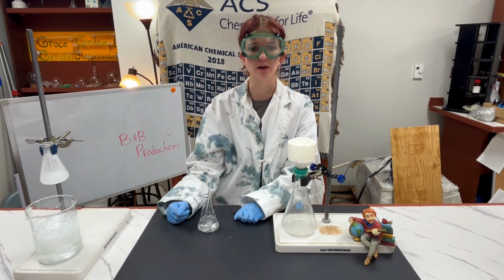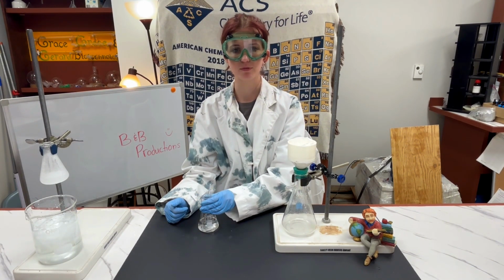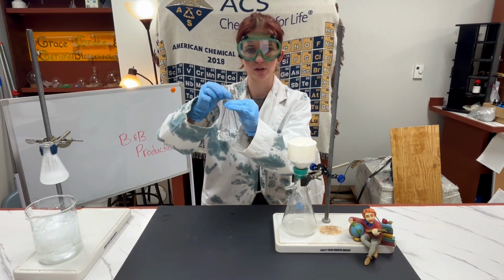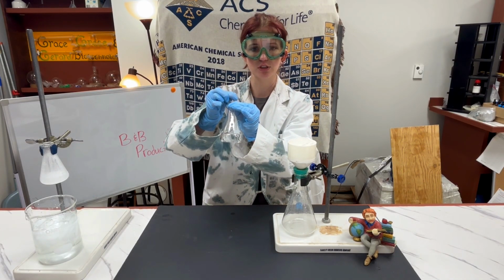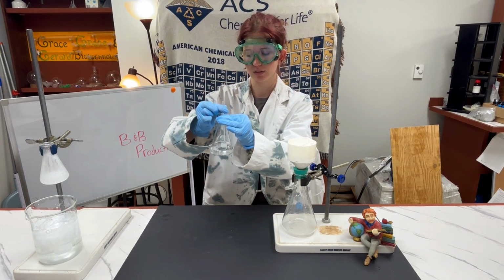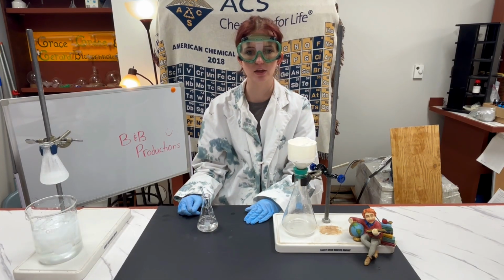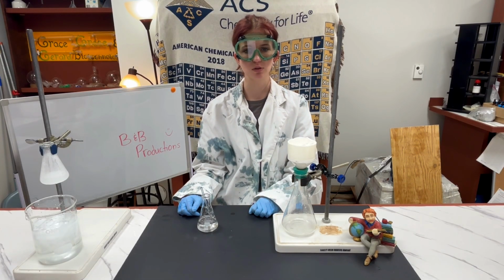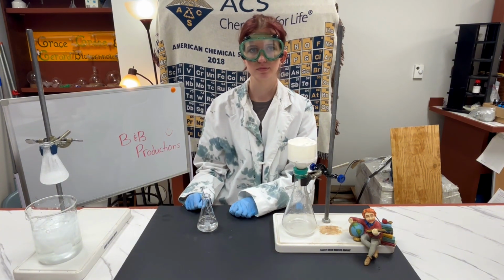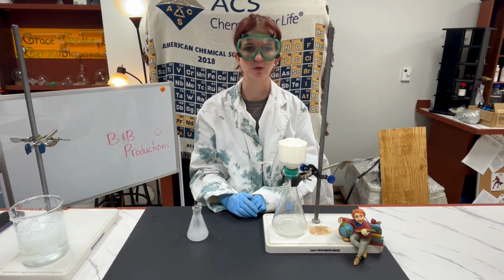If crystals have not yet formed after you've placed them in the ice bath, hold the top of the flask and scratch the bottom of the flask with the glass rod. This encourages crystal formation by creating vibrations within the flask. If this doesn't work, use a technique called seeding by taking crystals of the product and putting it inside the flask. Once the crystals have fully formed, collect the crystals by vacuum filtration.